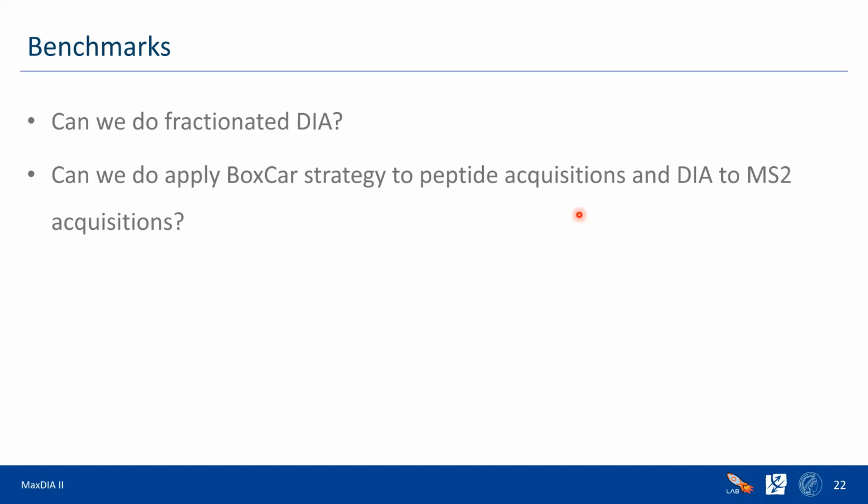And there's a way to actually fight this situation. You can sequentially focus not on the full range of masses, but on some small window. Let's say, it's a bit more complicated, but let's say from 200 until 300, and all peptides which happen to be here, you're measuring additionally.